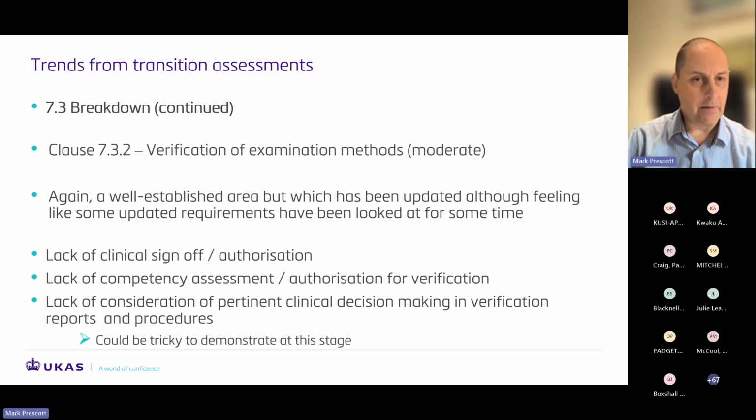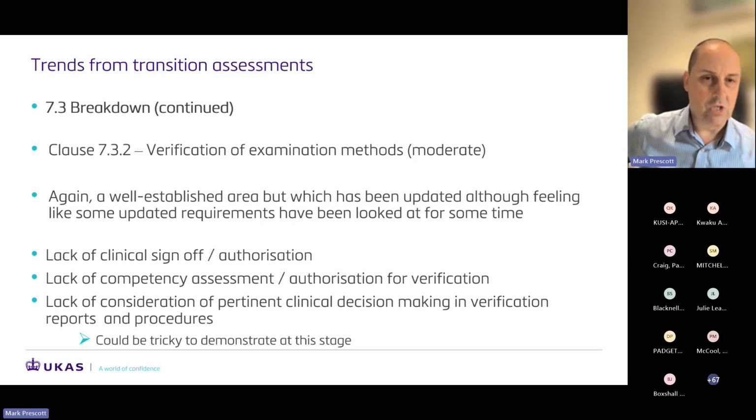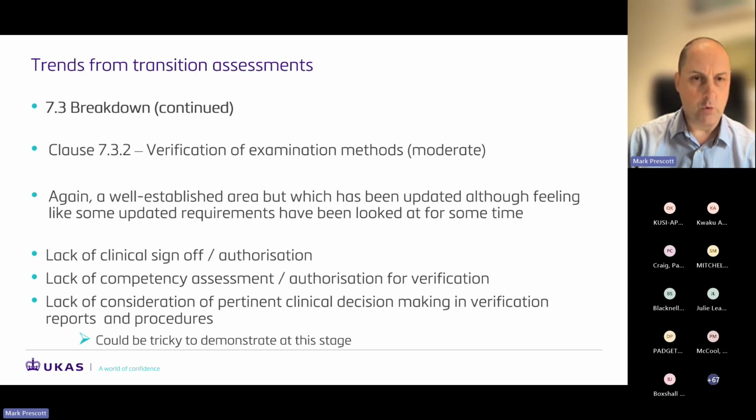So some of the key areas here are things like clinical involvement in verification. Some of those that we're seeing have a lack of clinical sign-off. They're very technically focused and not looking at the clinical implications of the assays that you're using and getting clinical involvement in the verification and sign-off. Also a lack of records around competency assessment. I'll come to this a little bit more on the next slide. There is now this requirement that people performing verifications are actually aware of what is required, almost being competency assessed and trained in doing verifications and being authorised to sign off verifications as well.